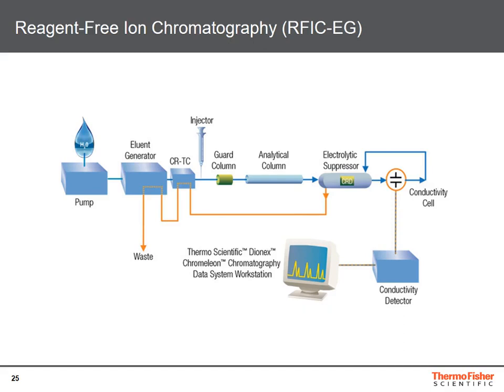Whenever we do this on this planet with carbon dioxide in the air, this carbon dioxide will diffuse into the hydroxide solution where it is converted to divalent carbonate ions. In other words, our hydroxide solution would contain an impurity with a higher eluting strength than the mobile phase itself. This would lead to very inconsistent data, especially inconsistent retention times.